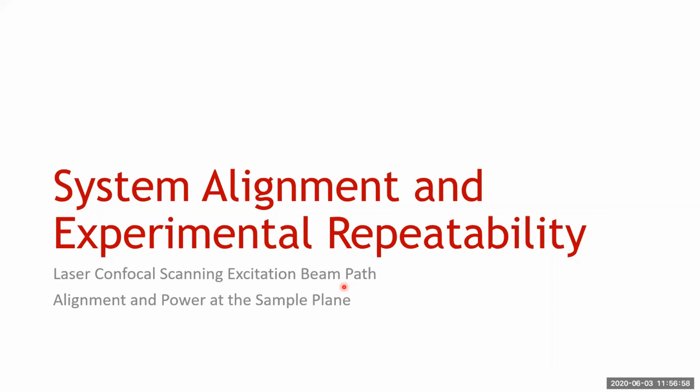Now, when you're talking about bit depth, if you want to reduce your image size, and your microscope or your detector allows anything from 8, 12, or 16, you can pick the 8-bit depth.